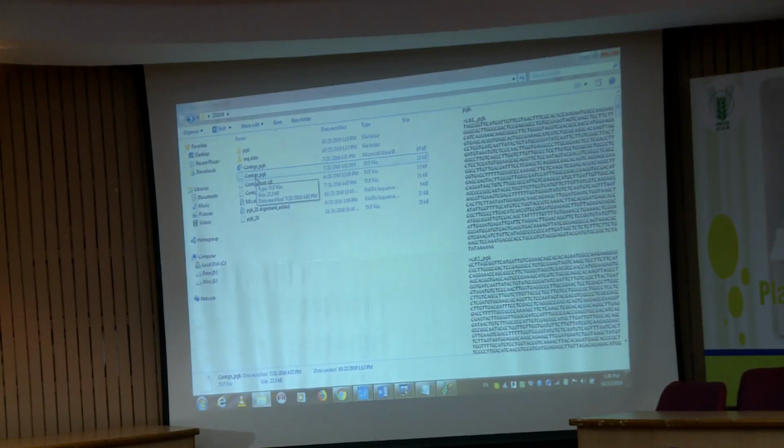I had sequenced around 10 of my samples using the same gene, and I want to compare them with each other. The sequence should be the same in all the samples. In sequencing, some reads will have extra bases at the beginning, some will start earlier, and some may start at a later stage. So my purpose is to get a clear-cut basis, where positions 1 to 500 should be the same among all.